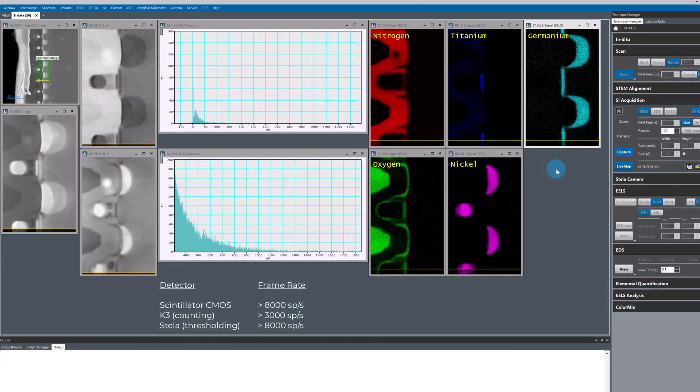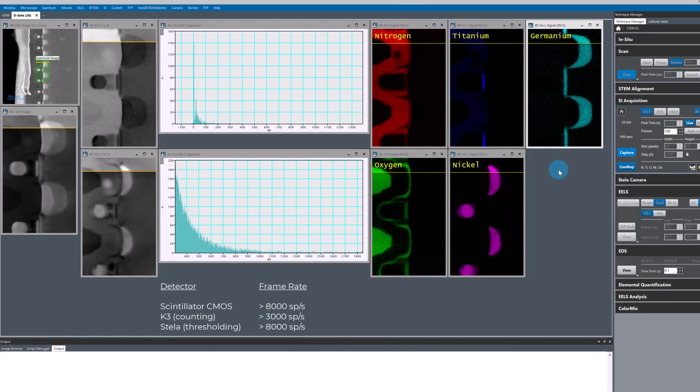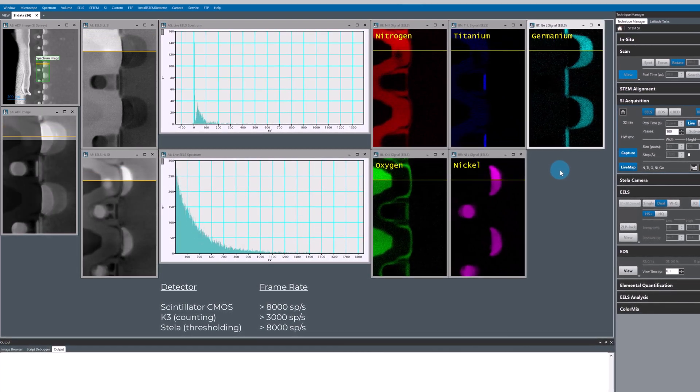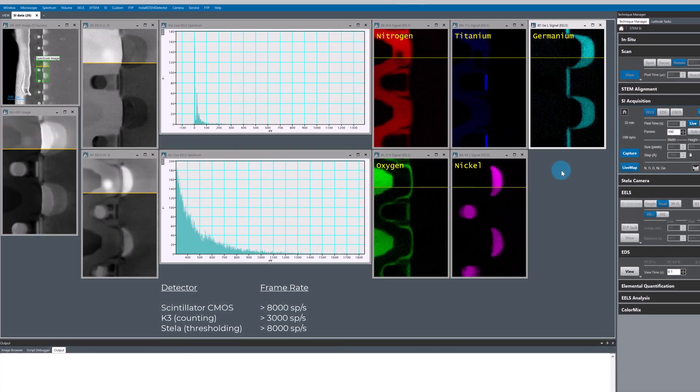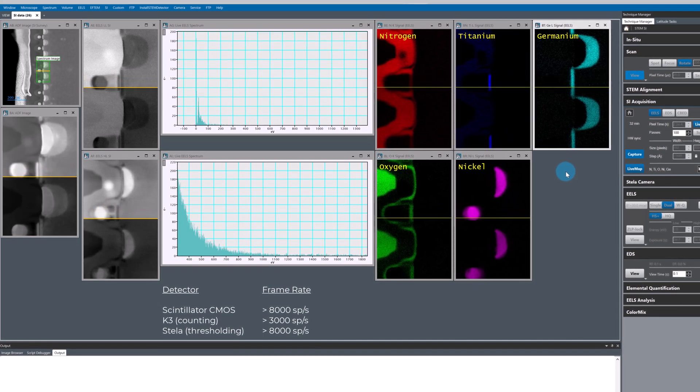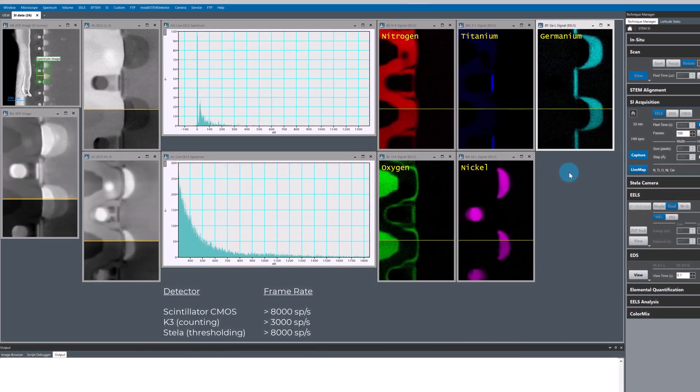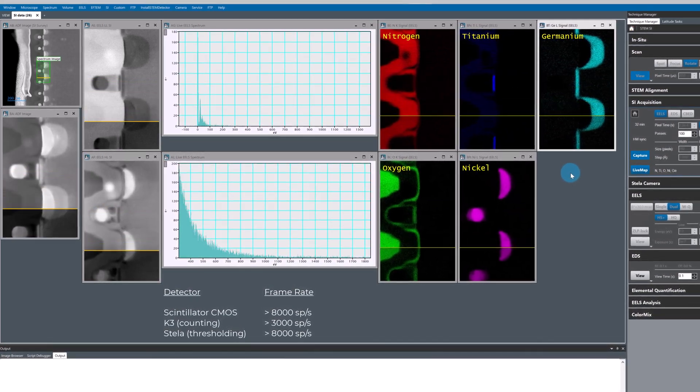So to help me choose when to stop scanning, I've enabled live mapping so I can monitor the signal to noise ratio in my elemental maps live as the data is being acquired.